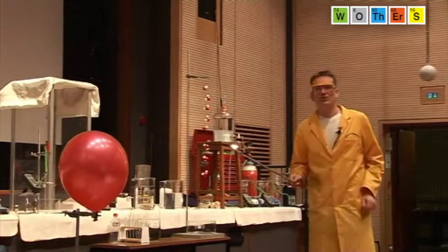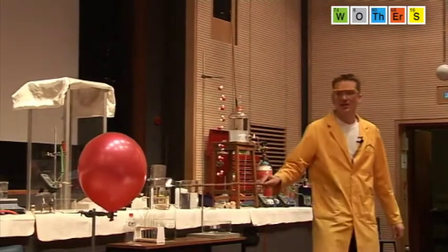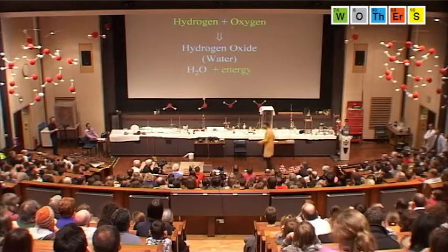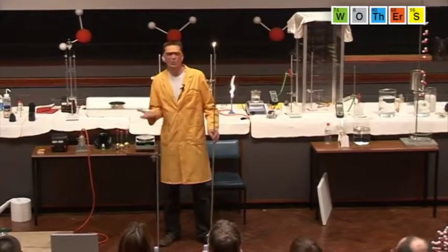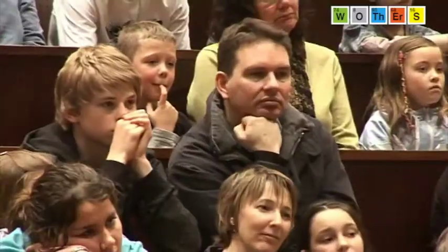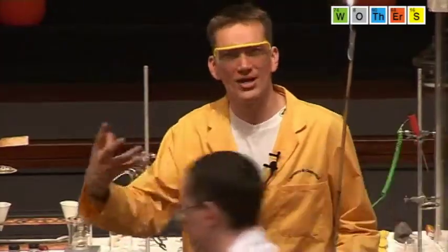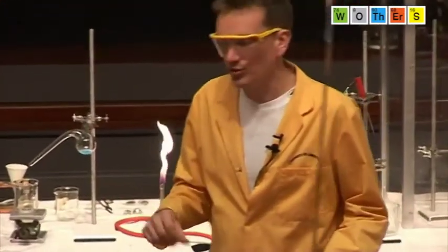Now, watch what happens when I apply a light to pure oxygen gas. Okay, are you ready? Not a lot. Okay, well, oxygen is not flammable. Oxygen doesn't burn. Oxygen allows things to burn, but itself doesn't burn. The hydrogen burnt very nicely because it was reacting with the oxygen that was in the air. The oxygen had nothing to do.